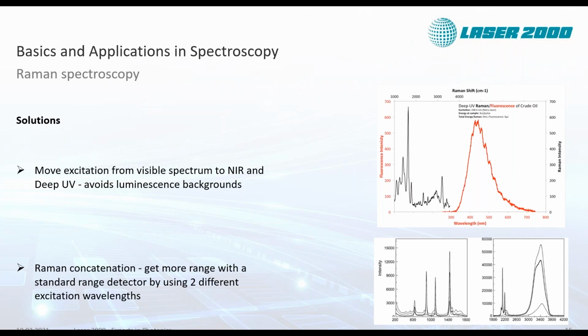And the other point is, if you want to measure luminescence or fluorescence spectra, these are not distorted by maybe intense Raman peaks. And as I said before, the fourth power of the wavelength law is valid here too. But as we go into the blue, we gain a lot more scattering efficiency in the deep UV.